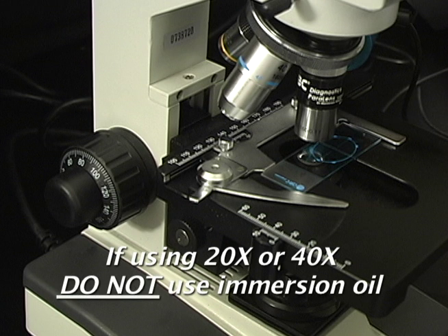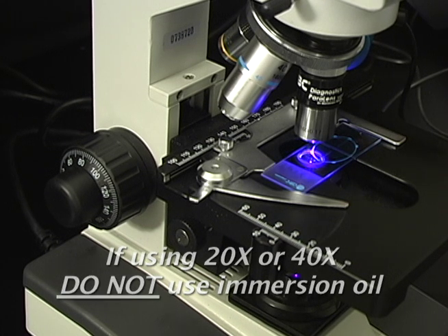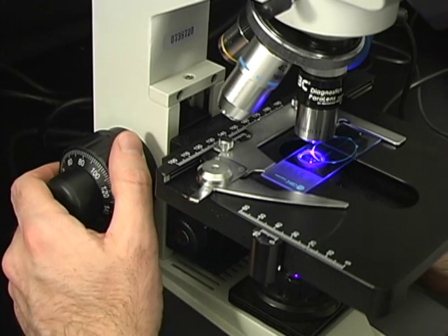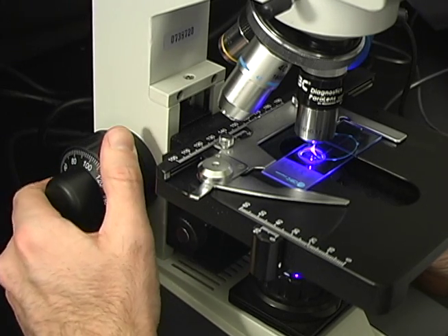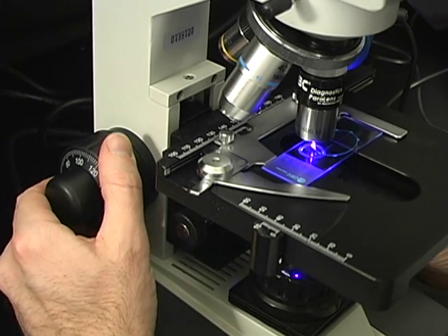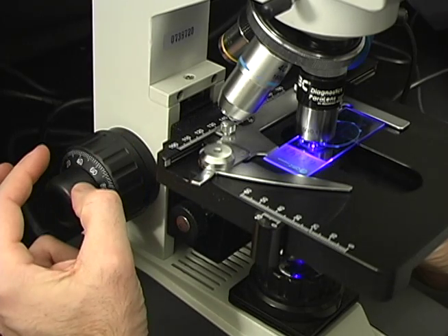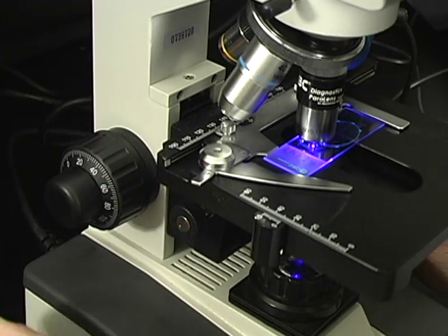If using the 20x or 40x objective, do not use immersion oil. Bring the objective down towards the slide with the coarse focus knob until the fluorescent marker comes into view. Then, fine-tune the slide into focus with the fine focusing knob.